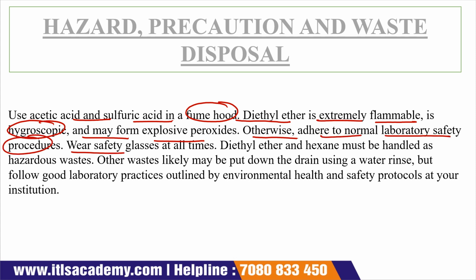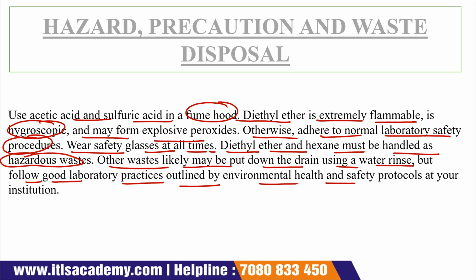Wear safety glasses at all times, and diethyl ether and hexane must be handled as hazardous waste. Other wastes may be put down the drain using a water rinse, but follow good laboratory practices outlined by the environmental health and safety protocol at your institution.